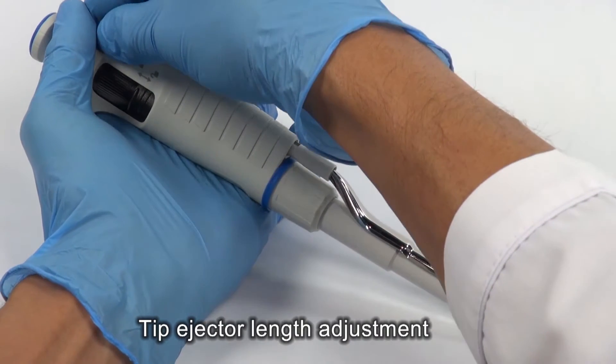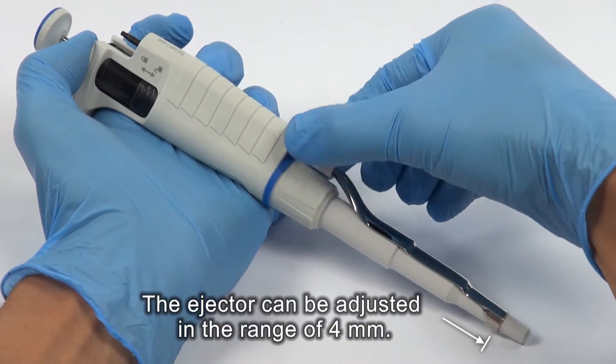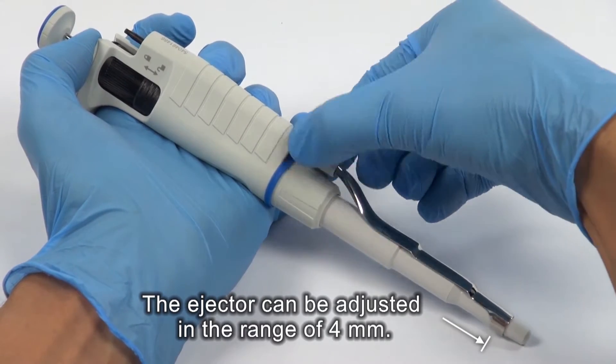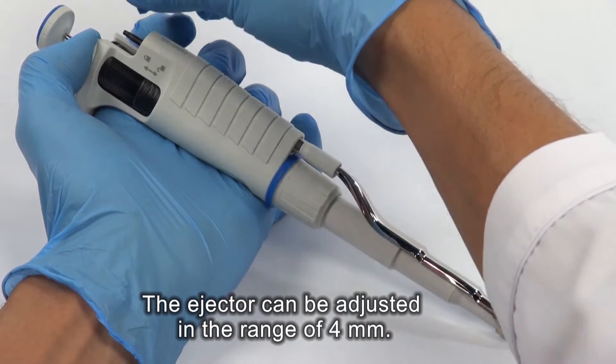Remove the tip ejector button. Turn the ejector bush to the left to lengthen the ejector. Fix the tip ejector button.